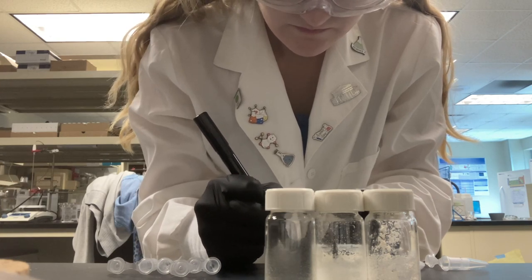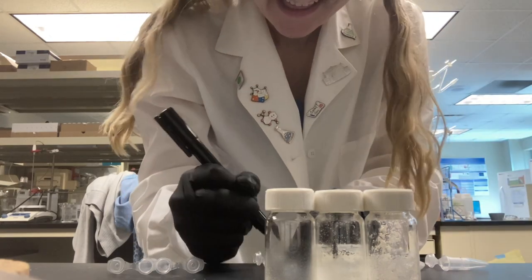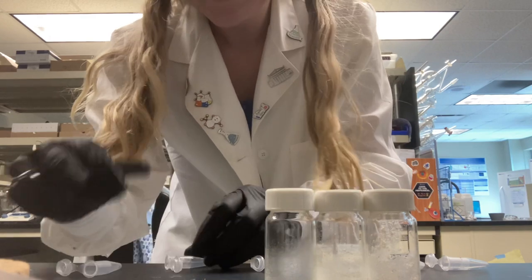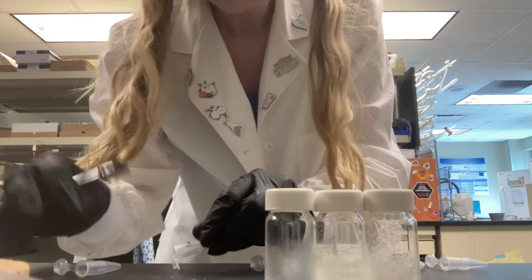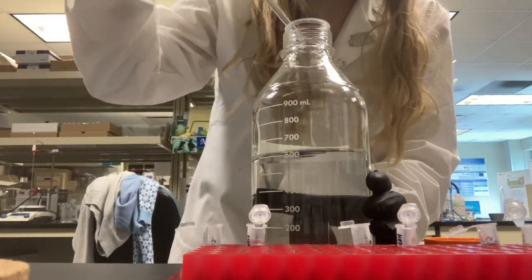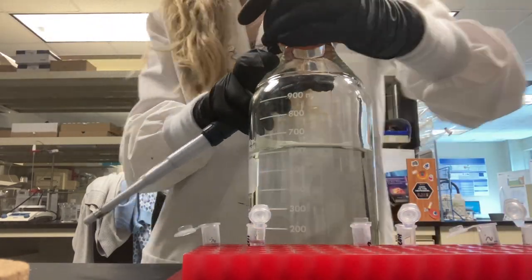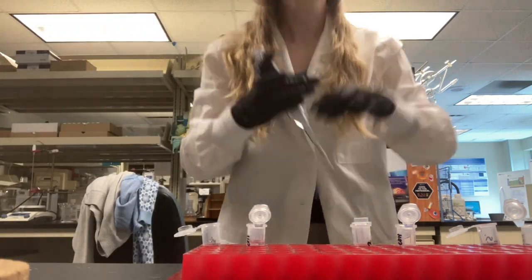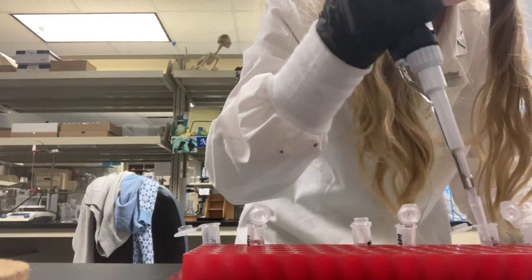Here I'm just labeling some Eppendorf tubes to put my compounds in to run a mass spec sample of each of them. Jenny in the background was displaying an interesting outfit because she forgot pants today. Here I am putting in some formic acid solution to be read by the mass spec. I use the same pipette tip — because each of the Eppendorf tubes did not have any sample in it, it's okay to do that, in case you were wondering if that's not good lab behavior.